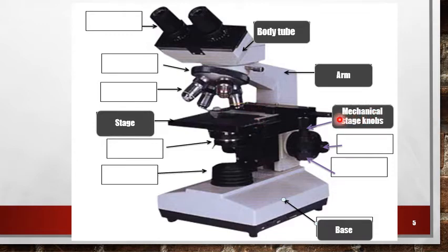Mechanical stage knobs: there are two types used for movement of the stage on the x and y direction.